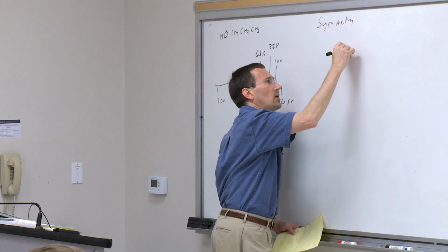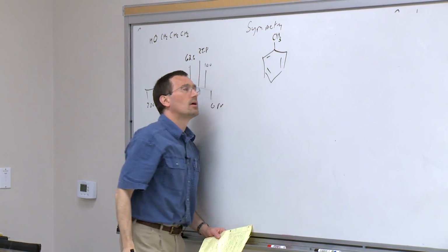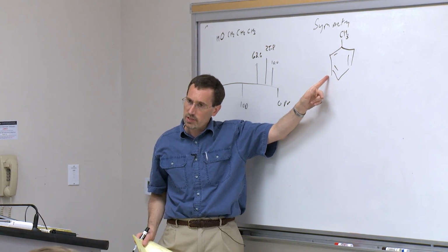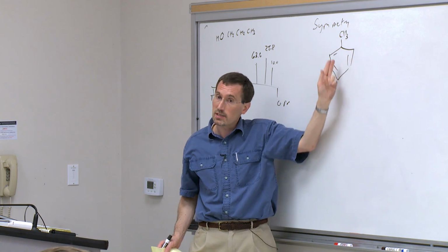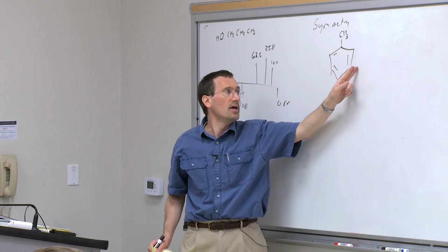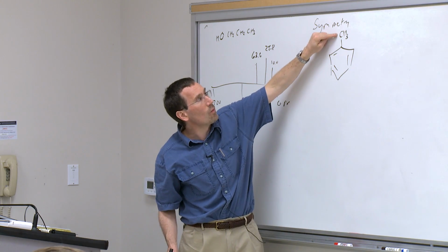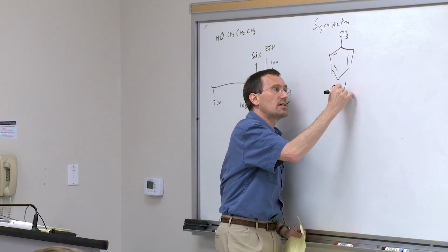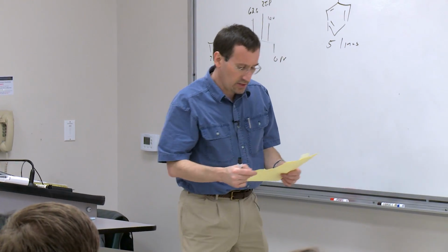And so, for example, if you look at the molecule toluene, even though toluene has 7 carbons, you wouldn't expect 7 resonances because the molecule has symmetry to it. In other words, the ortho carbons are identical. The meta carbons are identical. So you'd expect not 7, but 1, 2, 3, 4, 5 lines in the C13 NMR spectrum.